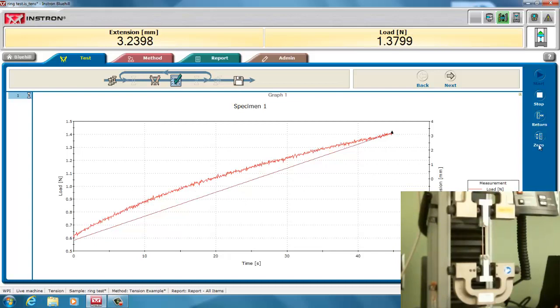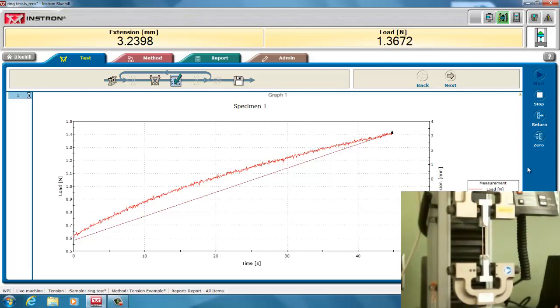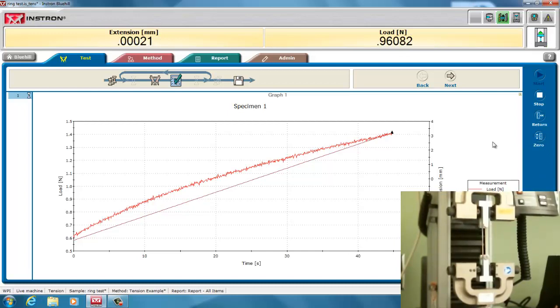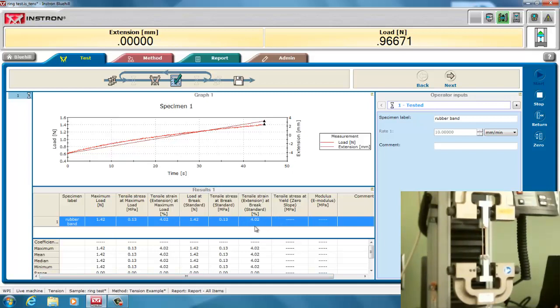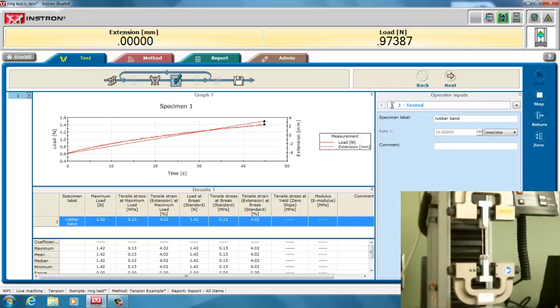And I will mention that I did forget to zero the extension before starting the test. And that should always be done. Because right now when I return, I don't know where exactly it's going to return to. And here it gives us our values. Again, it's set up for breaking and it doesn't have our modulus because we didn't go far enough. But that's the general way of setting up the test for a ring test. Thank you very much.